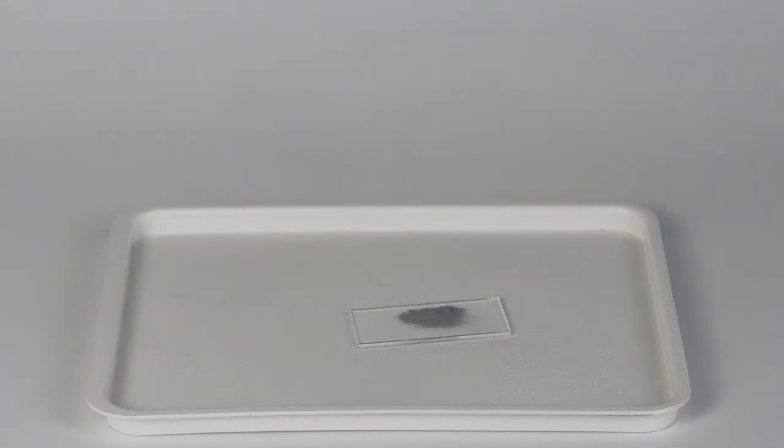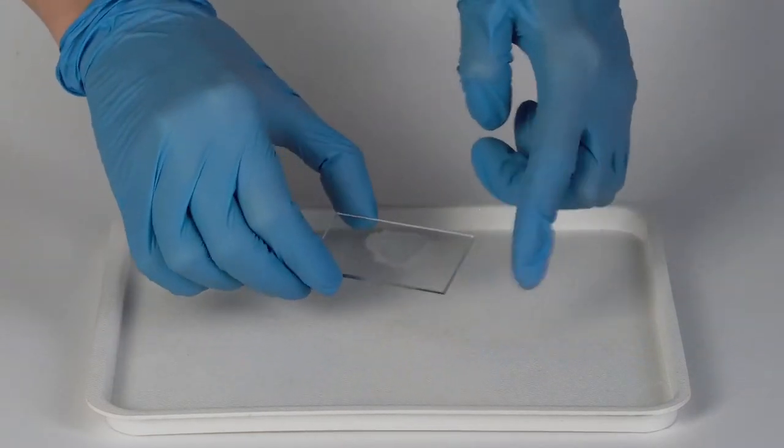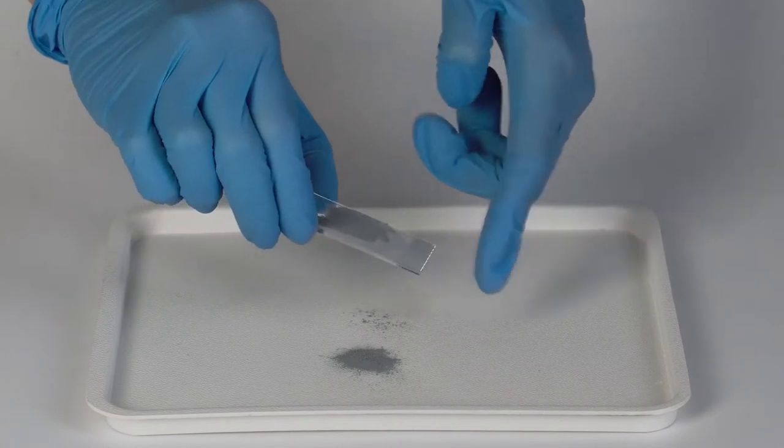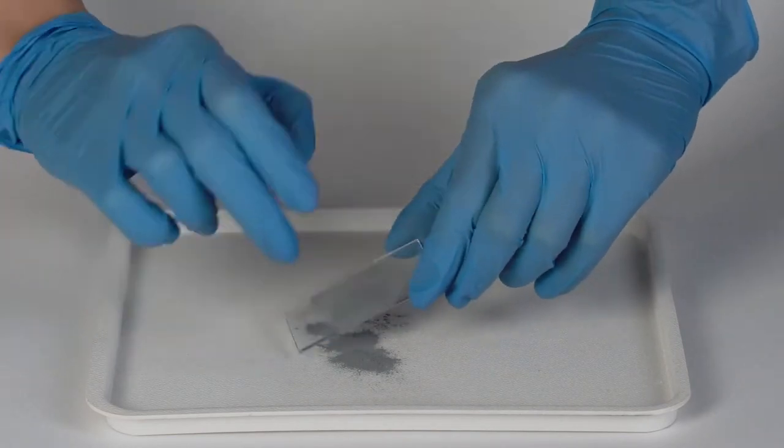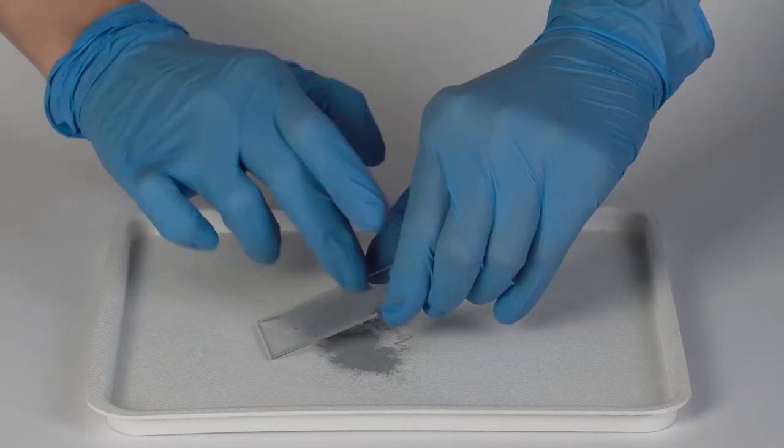Carefully shake the glass slide to distribute the zinc on its surface. Hold the glass slide over the plastic tray and turn it over. Gently tap on the back of the slide to remove any remaining zinc powder.